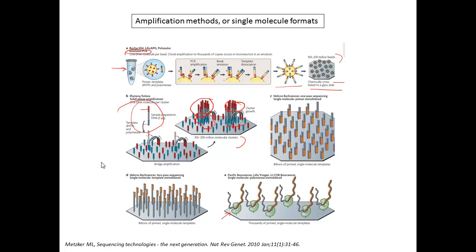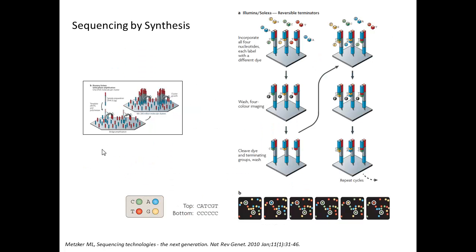So when we look at the sequencing reactions, we'll start by talking about this example where we had single molecules amplified on the surface, creating polonies. So just as a reminder, this is the amplification that we're talking about. Now here we see three different polonies, and they've only shown one DNA molecule for each of these, but we have them attached to the surface because they were amplified with primers attached to the surface. We're going to put a sequencing primer on there. We're going to start doing base pair extensions, so we'll do the sequencing reaction right there on the surface.